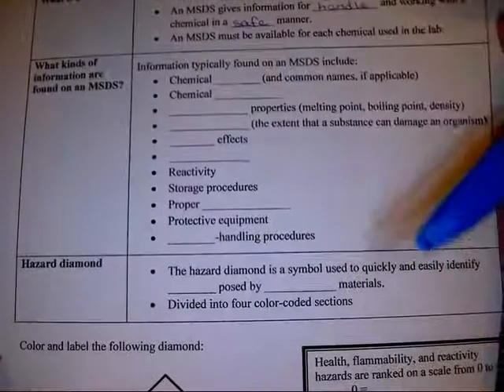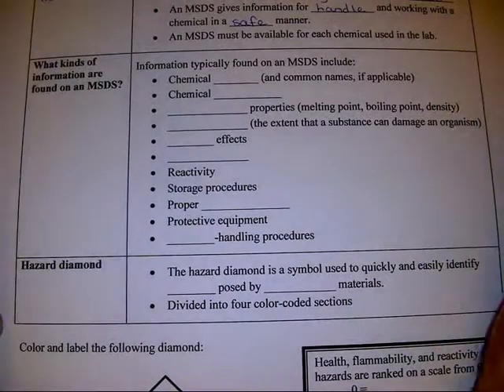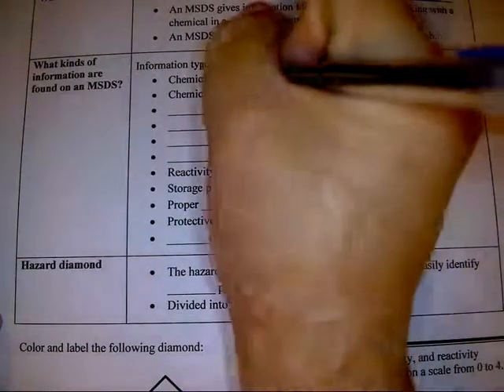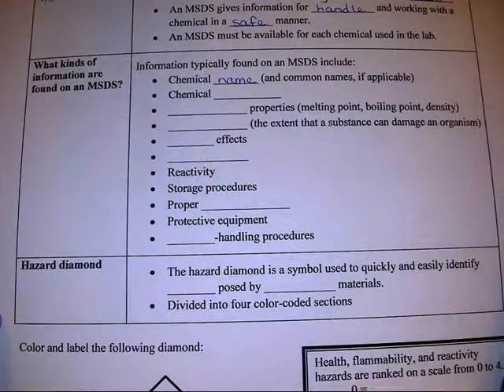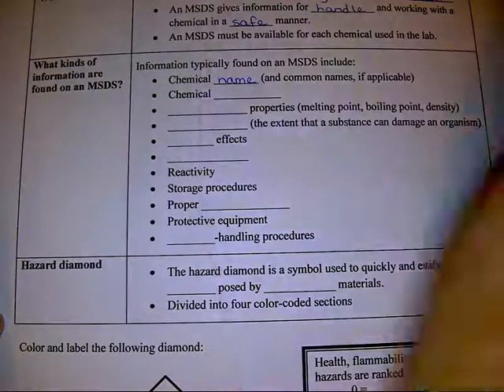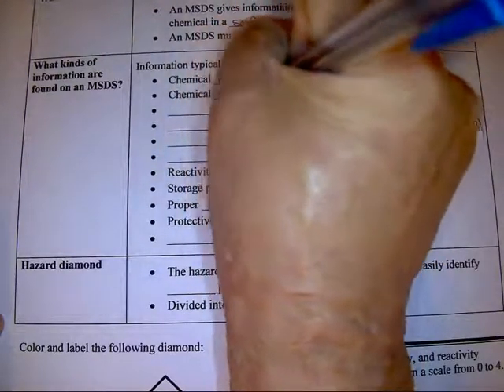Now, the types of information that can be found on an MSDS would include the following. We will have the chemical's name and any common names. For example, sodium bicarbonate has a common name, baking soda, so both names will be on the MSDS. It should have the chemical's formula.